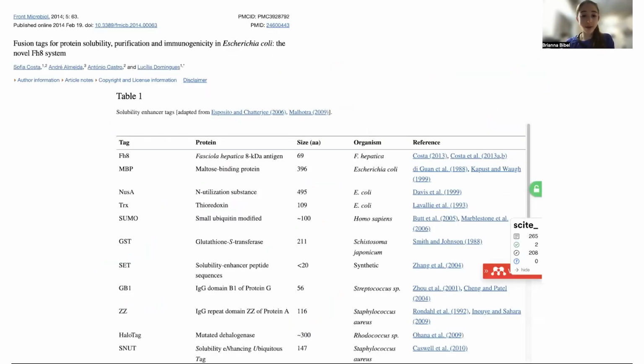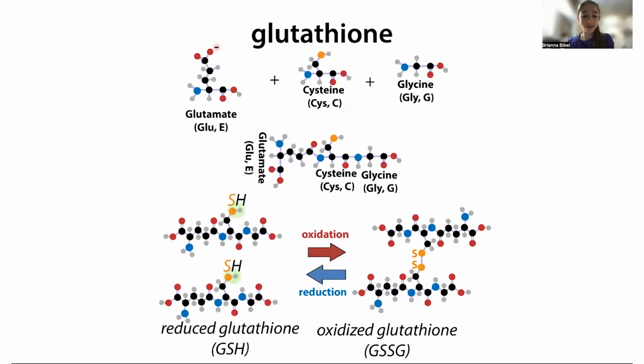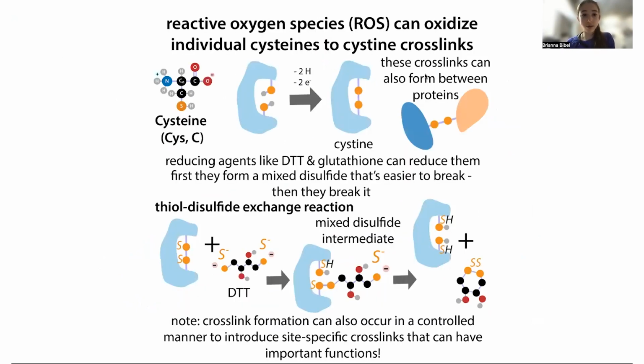In the case of some of these fusion partners, like GST and MBP, they can actually act directly as affinity tags. So GST is glutathione S-transferase. Glutathione is this little antioxidant molecule that our cells use to help maintain a reducing environment, so that cysteines in proteins don't form unwanted crosslinks where these cysteines hook up to one another. There's much more on this in my post on cysteine. But glutathione is what your cells use instead of what we use in the lab, like DTT. Glutathione is a cellular version of that, or DTT is the lab version of it. Basically, these are used to help maintain a reducing environment and prevent these unwanted cysteine crosslinks from forming.